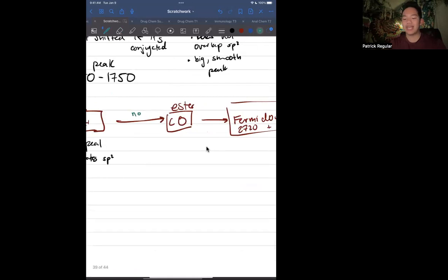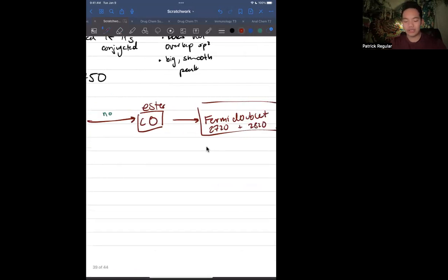The next consideration is an ester. Now, for an ester, what we give you is 1200, around that range. But again, if you have an ester peak, you have a range, 1150 to 1250, right? Anything around that. And if you have a tall peak in that region and you have a carbonyl carbon, you're thinking, oh, could it be an ester? Most likely, because you have a peak there. And if your molecular formula were to have two oxygens, more than likely it's going to be an ester.